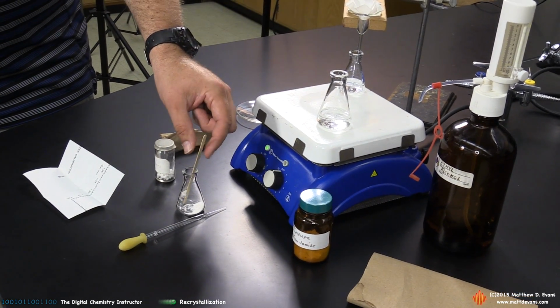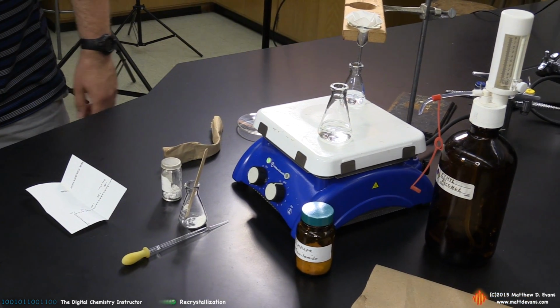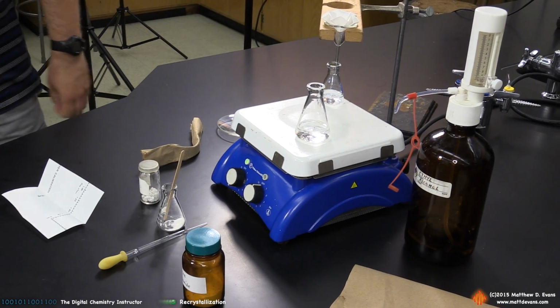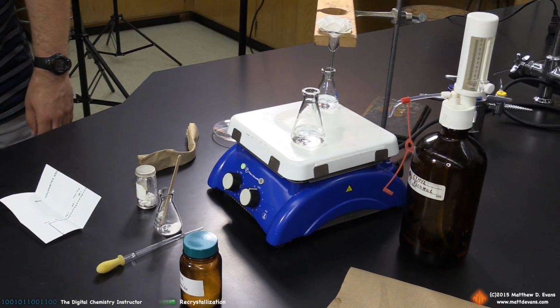So you can always find these in the organic cart. You can find the boiling stones in a little cubby hole in the cart. The impure sulfanilamide is available somewhere. We've also got a pure form of sulfanilamide somewhere for later when we're starting to do melting points.